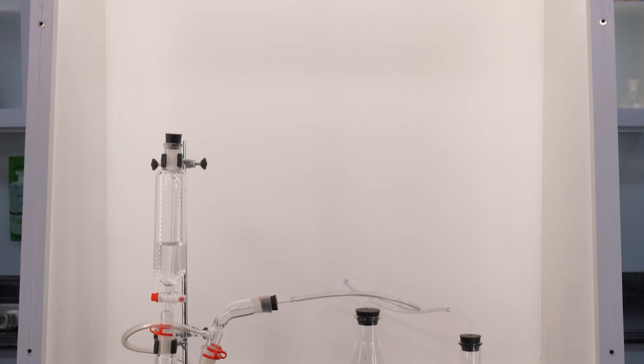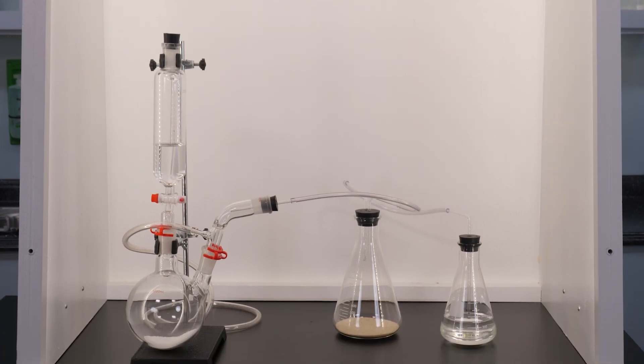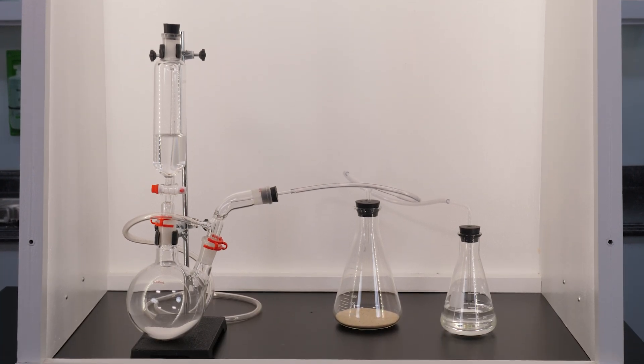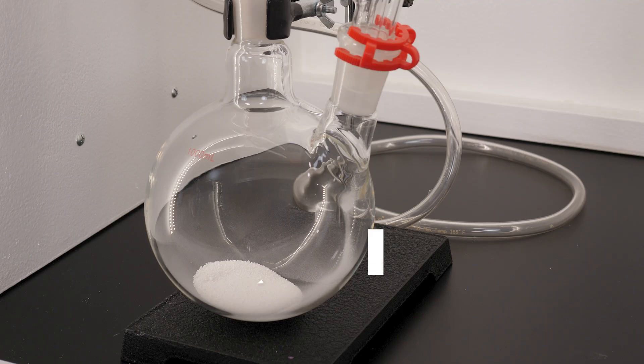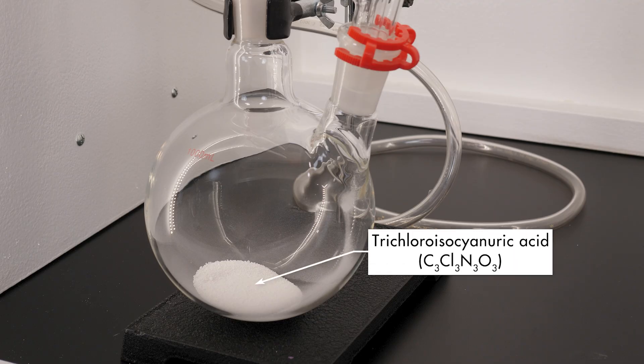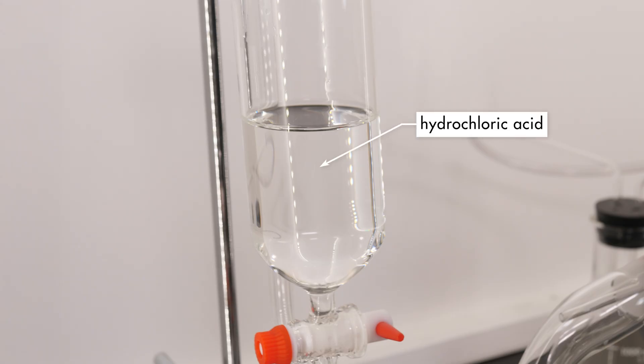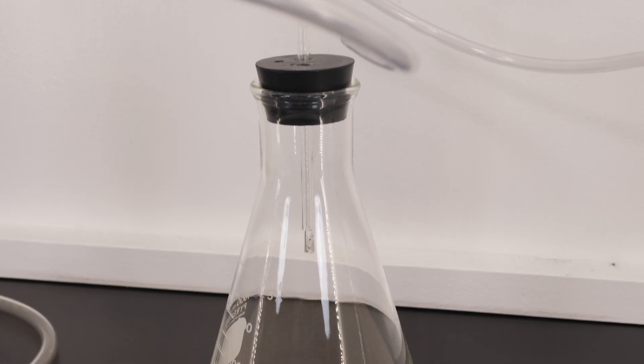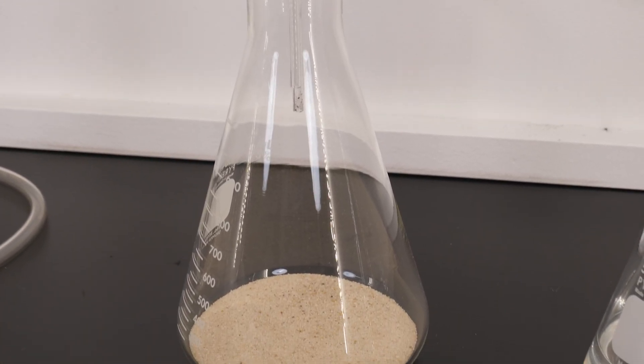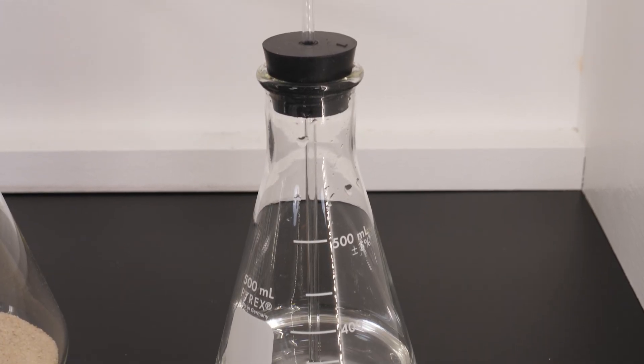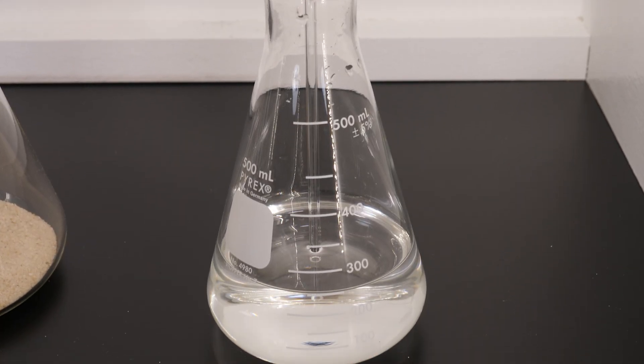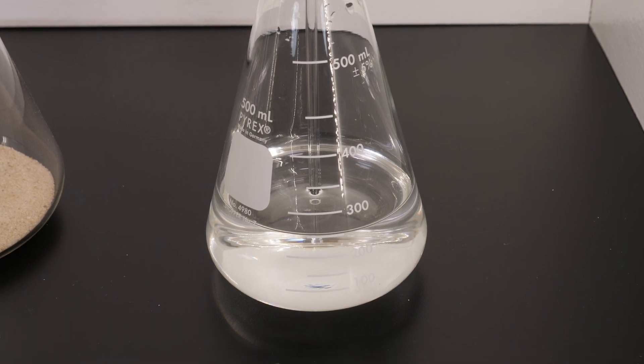Exposure to chlorine gas can cause severe respiratory problems. To generate enough chlorine gas for this reaction, we will use this laboratory setup. In this setup, trichloroisocyanuric acid will react with hydrochloric acid to produce chlorine gas. Chlorine gas will be collected in this flask. Excess chlorine gas will be neutralized with sodium hydroxide in this last flask.